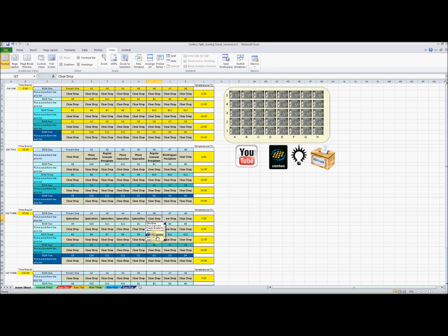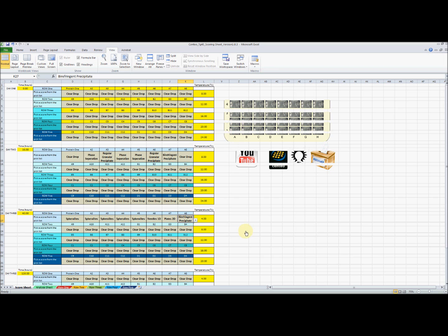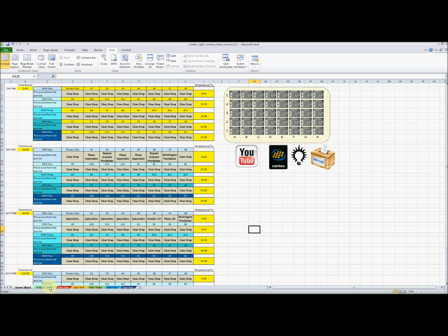And I'll score one of them a little bit higher. This is nice because you can automate your scoring process. By that I just mean go in the lab, quickly do it, and then this piece of software will allow you to quickly come back and analyze it.